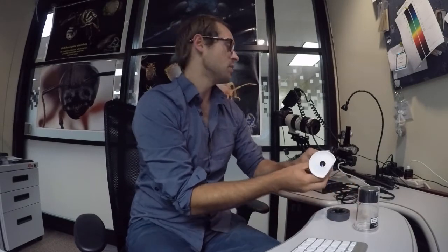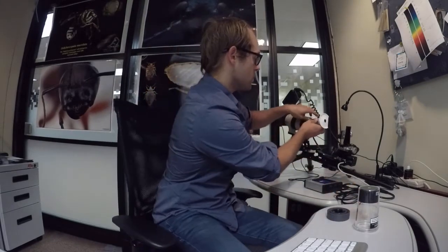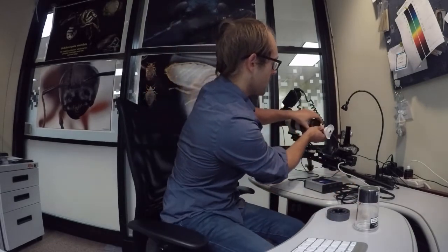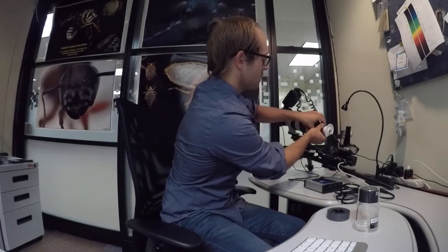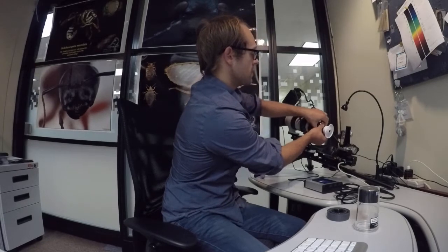Take the objective, take its base off, and using two hands, you just want to tighten that onto the front of the adapter.